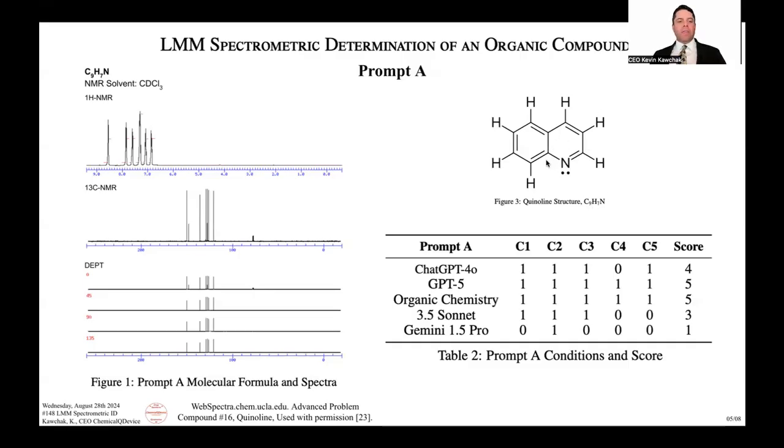That's coming from there. And then the other 2, this one and this one, which have 4 bonds, well, this one has 3 carbon bonds and one of them is double bonded. They're not quaternary, but if you look at that 0 spectrum, this is what's coming off, or is easier seen on the C13. These 2 peaks right here are coming from these 2 carbons that don't have hydrogens, or CH2s or CH3s. Okay, so going through that process, it looks good.